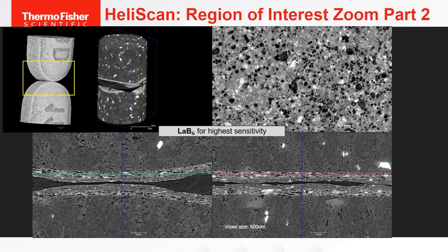Okay, right. So when we want the highest resolution, maximal sensitivity, we would switch over to the LaB6, and now we can see not only the dense particles, but the multiple phases of some of those low density materials inside this pill, to be able to pull out API as well as segment out, if you're asking questions about how much of it is there, volumes.